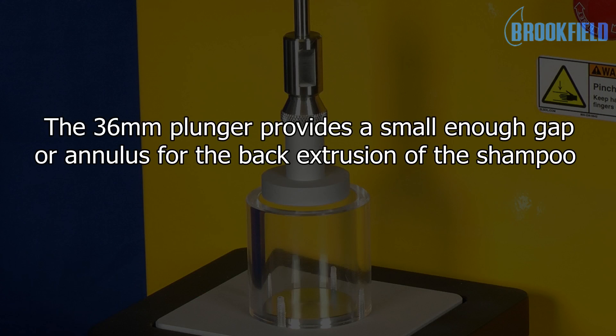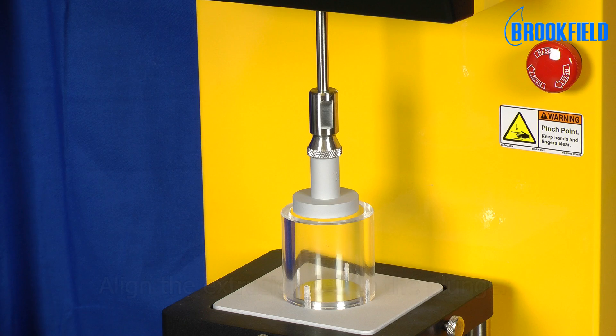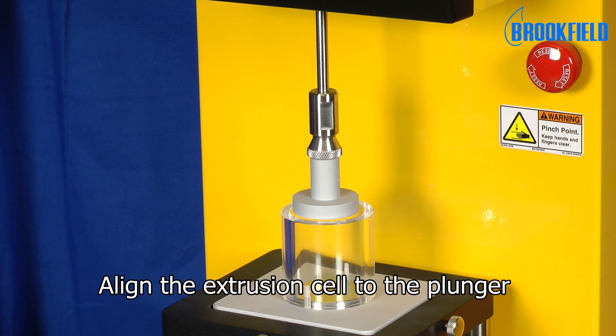The 36mm plunger provides a small enough gap or annulus for the back extrusion of the shampoo. Align the extrusion cell to the plunger.